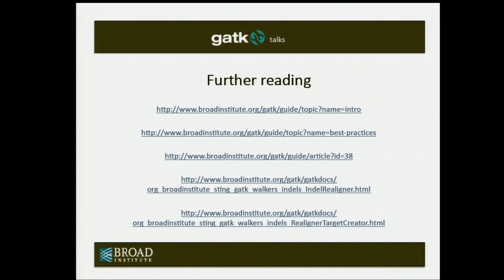The other thing to point out is we talked about these project designs. You might have lots of low coverage samples or one large sample. What you basically need for the Indel realignment is enough data to realize that something's going on. If you have one sample with only 4x coverage, 4 reads per base, you're not going to be able to do any realignment, really. It's too difficult because you don't have enough evidence of any events, especially at a heterozygous site where there's potentially only 2 reads.